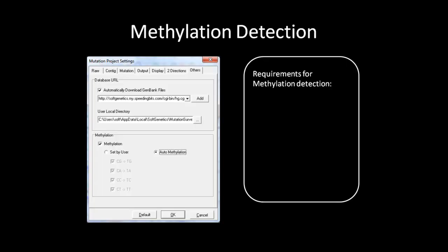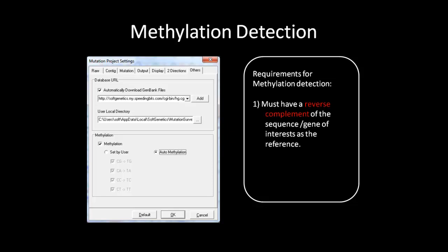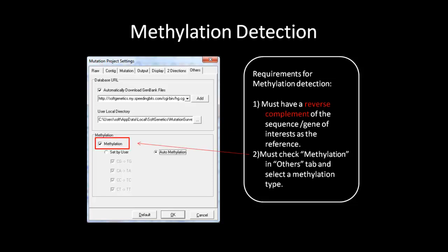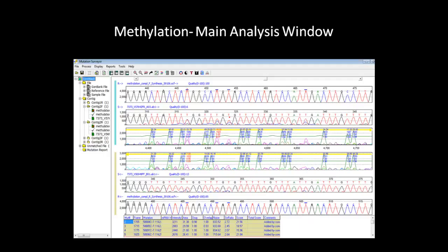Mutation Surveyor has options to analyze sequences that have undergone bisulfite treatment to detect methylation. There are a few requirements that must be met in order to complete a methylation analysis. The first requirement is the need for a reverse complement of the sequence or gene of interest as the reference. The second requirement is the selection of methylation under the Others tab in the Process Settings. You can either set your own methylation or select auto methylation. Once you have completed these two requirements, the analysis can begin.